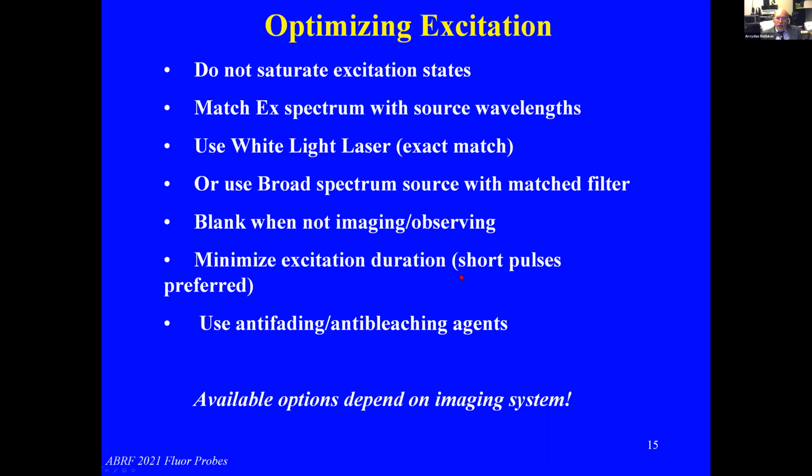So in that case, we also need to take into account the distance between excitation emission peaks, which for the best results should be about at least 100 nanometers. The spectra should have minimal spectral overlap.